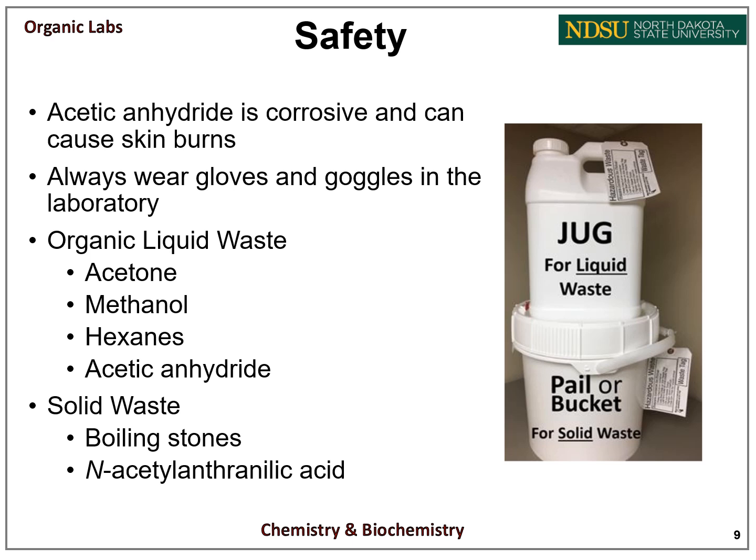And some safety considerations. This week we will be working with acetic anhydride, which is corrosive and can cause skin burns, so please always wear your gloves and goggles while in the laboratory. Beyond this, we will be generating waste. Things that will go into the organic liquid waste jug are things like acetone, methanol, hexanes, and acetic anhydride. Things that will go in the solid waste bucket are things like boiling stones, our product N-acetylanthranilic acid, and any contaminated gloves or paper towels.